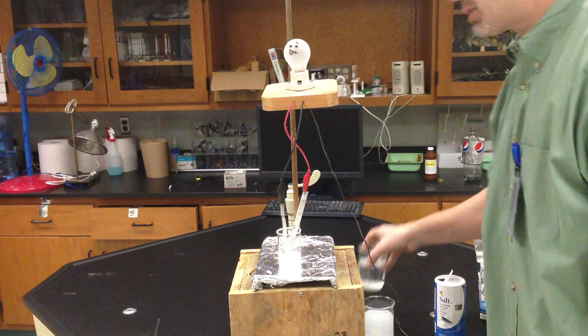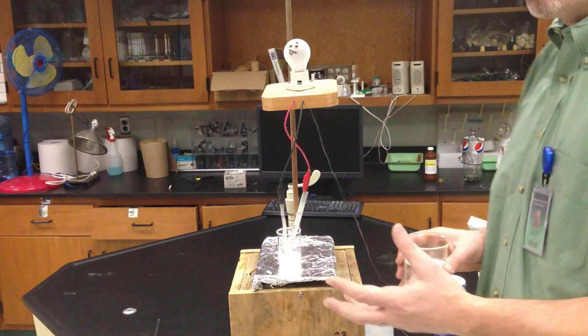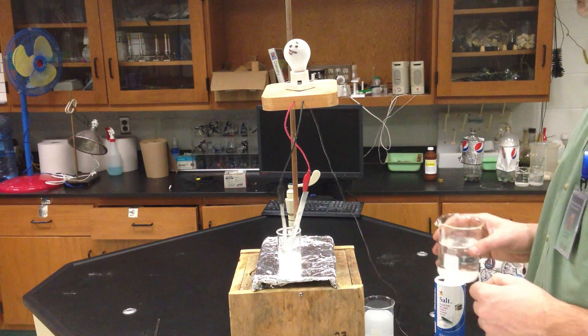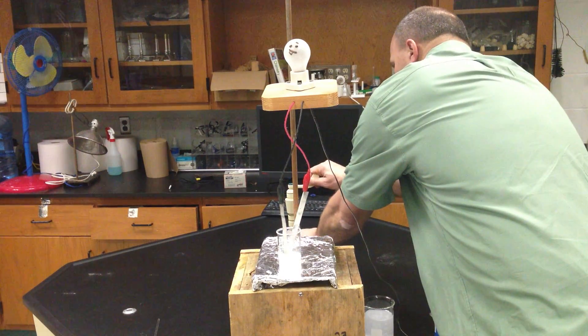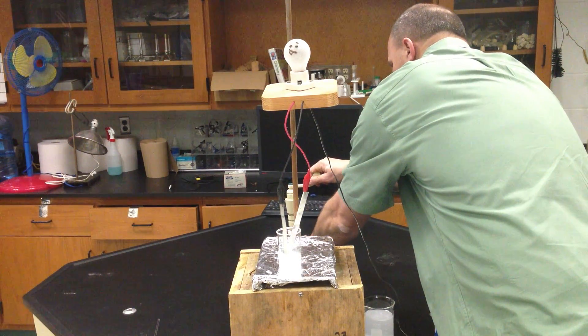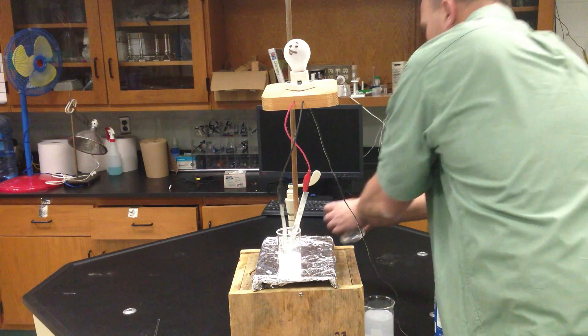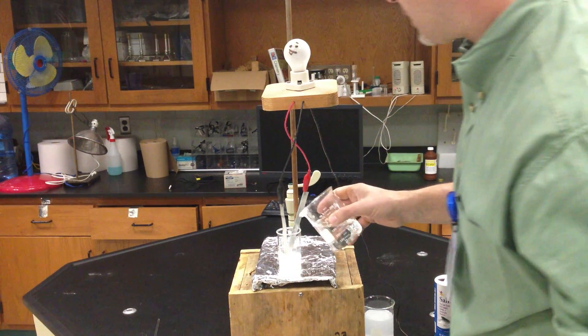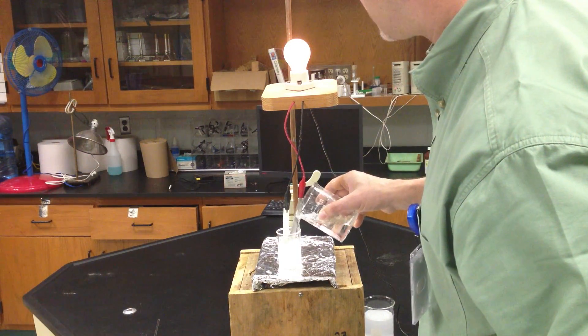And the reason behind that is because the ions are locked in a crystal. The ions cannot move when they're locked in that crystal. So if I was to add just some water to this system, hopefully I dissolve some ions. And by dissolving some ions, I should get my light bulb to light up.